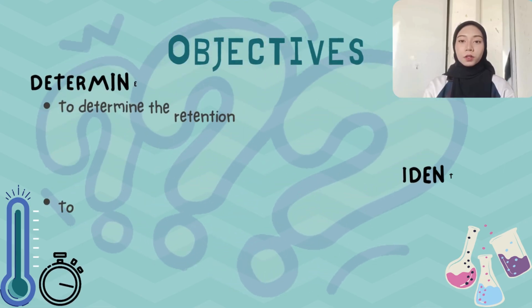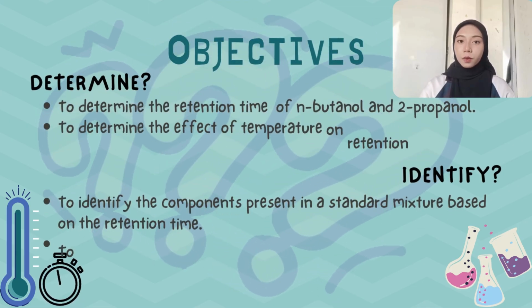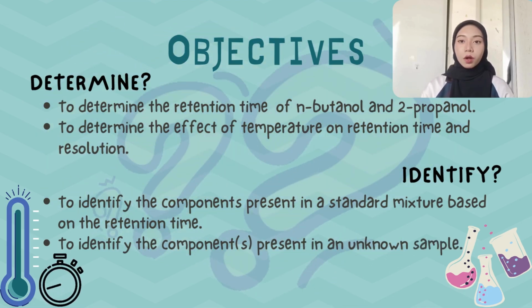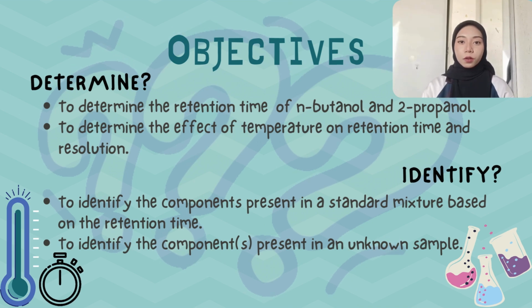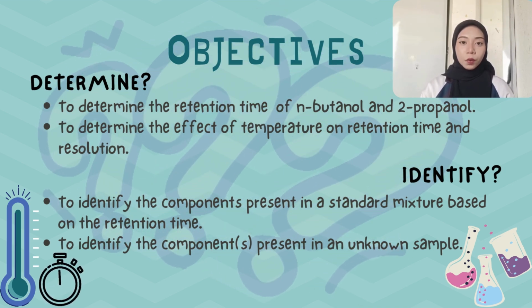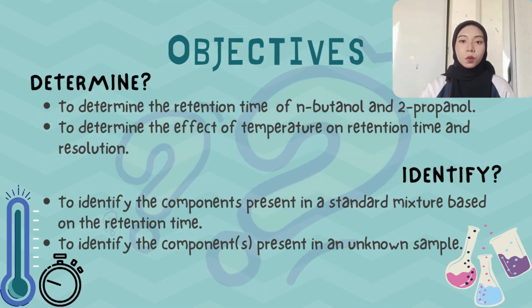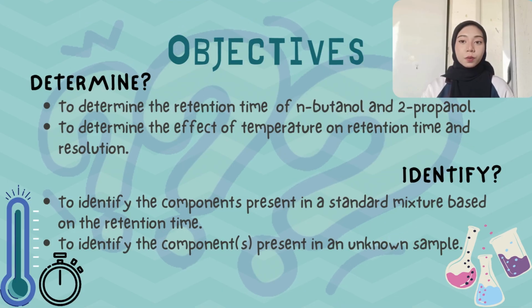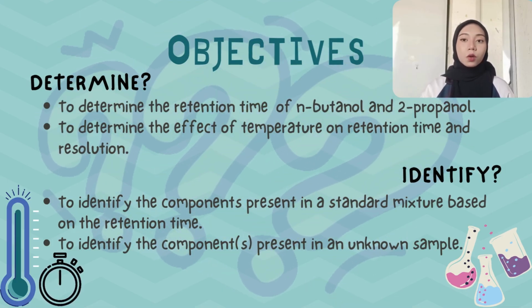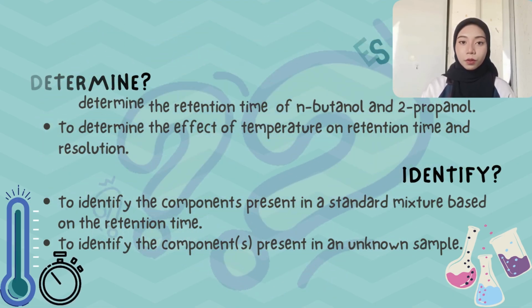Now, we are going to look at the objective of this experiment. This experiment was run to determine the retention time of N-butanol and 2-propanol. Next is also to determine the effect of temperature on retention time and resolution. We also wanted to identify the components present in a standard mixture based on the retention time, and also to identify the component present in an unknown sample.